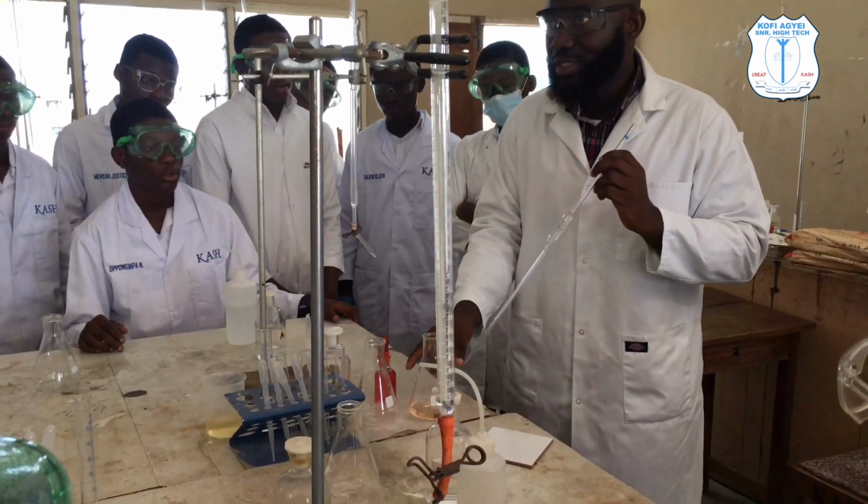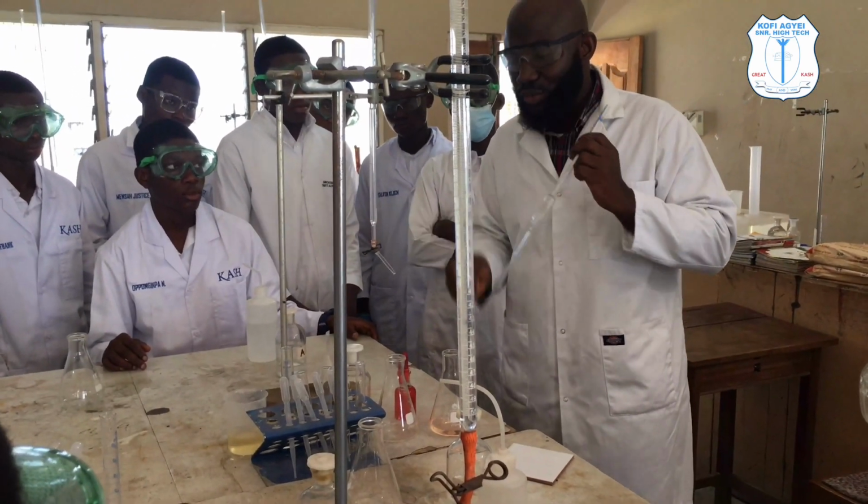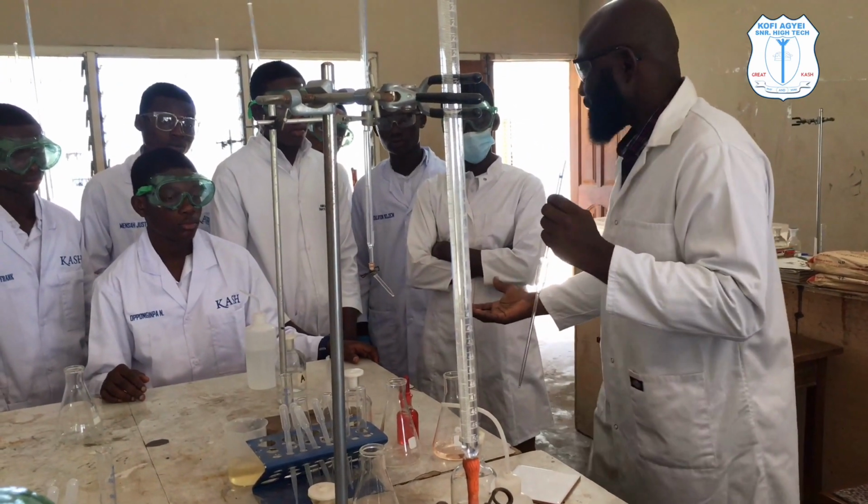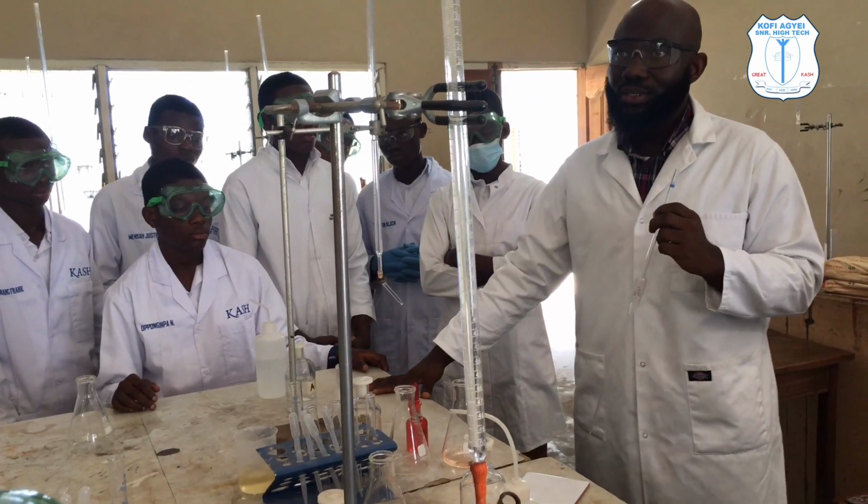What color do you need to get? Yellow. You do the titration nicely to get what? Pink. So basically, that is all, orange or pink, depending on the nature of the substance. Please, any questions?